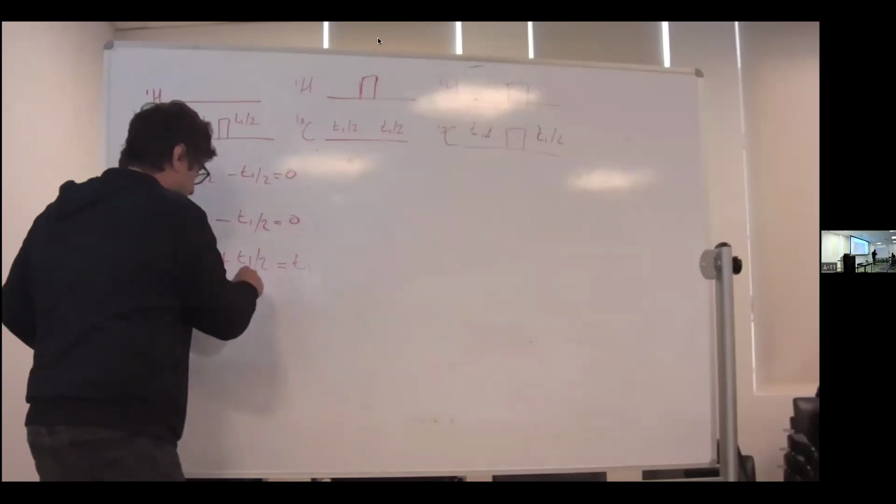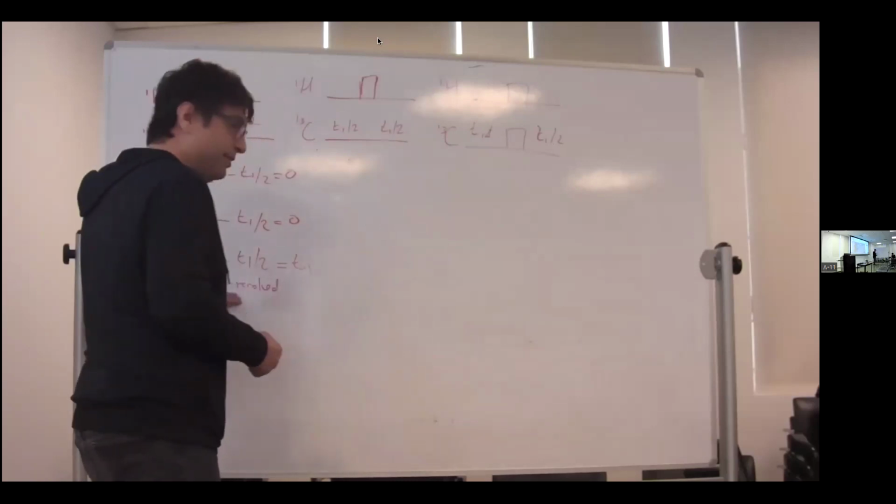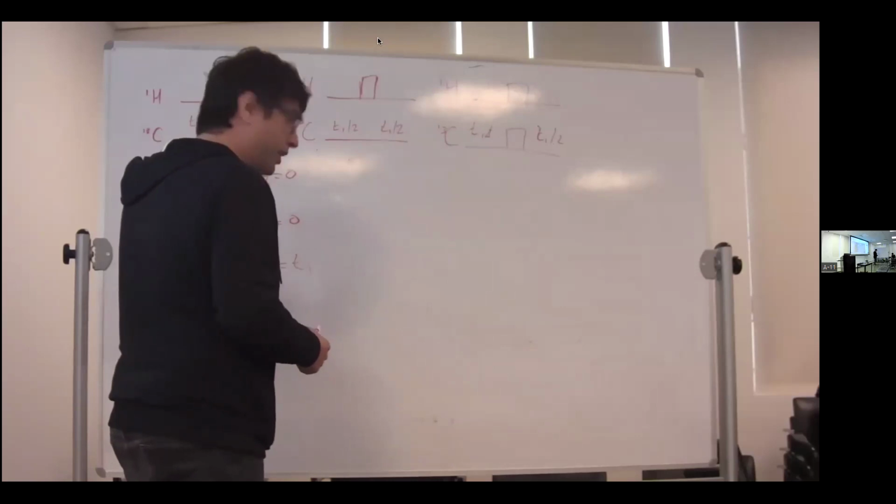Nobody does this type of thing anymore because you get no chemical shift resolution in two dimensions. But this is the thing. It's J-resolved spectroscopy. You get a J column.